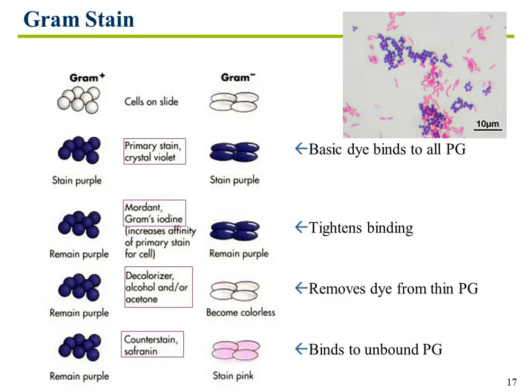Okay, so I've already introduced you to the gram stain, but now I want to get into the mechanics of it. We're going to be doing this umpteen times in lab, so you'll get a lot of experience. Note the gram stain up at the top right. You're looking at it on oil immersion. You've got 2 different kinds of bacteria there.